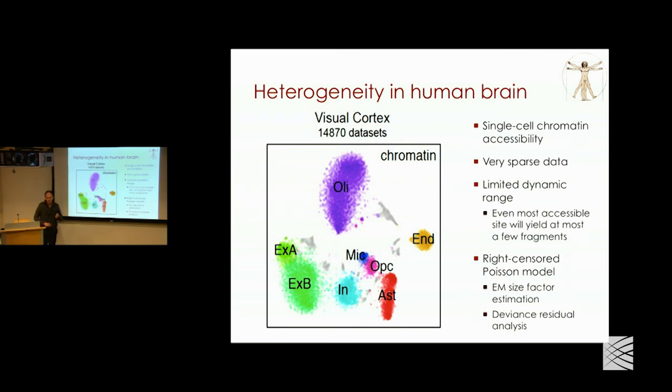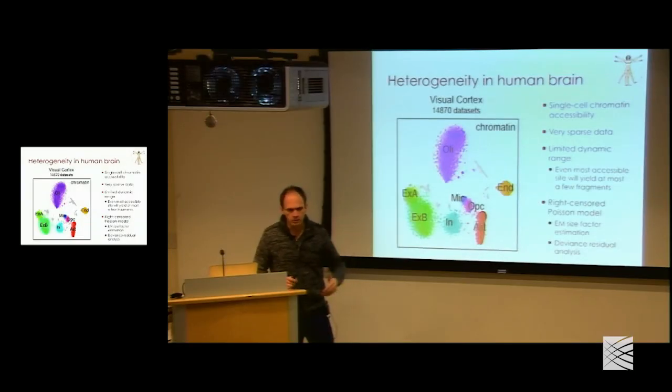So essentially at the end we get nuclei measurements again, but of chromatin accessibility, right? So we get reads in positions where the nucleus was able to access the DNA and make the cut, right? And obviously there are a lot of genome positions where you could potentially make a cut. So we focus on peak positions, which we get from pooled data, pooling across all the cells and just looking at positions where there was a statistical increase in the number of actual reads. So this allows us to get a signal per cell, like we have genes per cell in transcriptional measurements. Here we have reads at peak positions, usually enhancers or promoters, per cell. There are usually a lot more of them than genes.